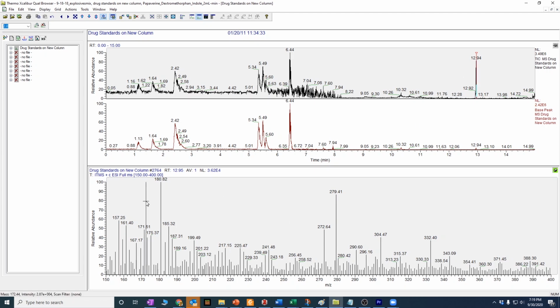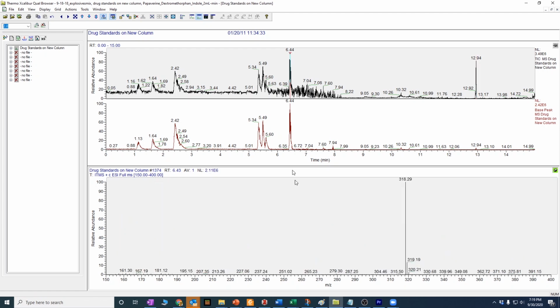So up here, the signal was add all these together. Down here, this little bump is just this guy, just the tallest peak in the spectrum, 3.62. Before, it was accounting for all these little peaks and adding them all together. Now it's just taking the intensity here. So you can see the way we look at the chromatogram makes a very big difference.